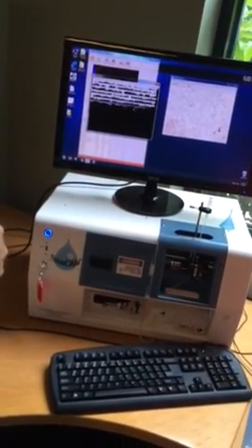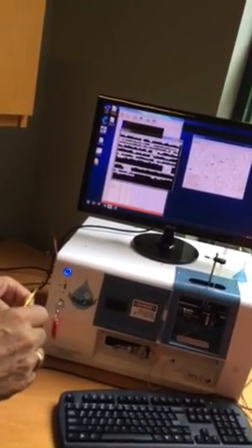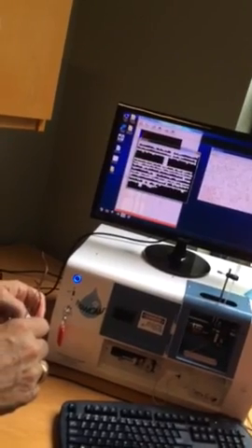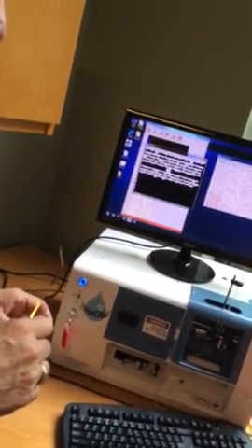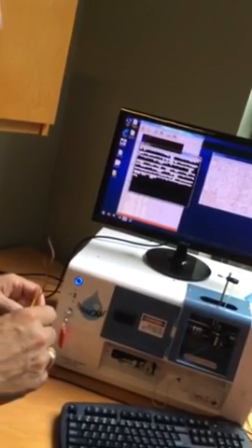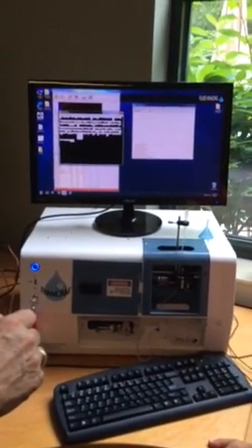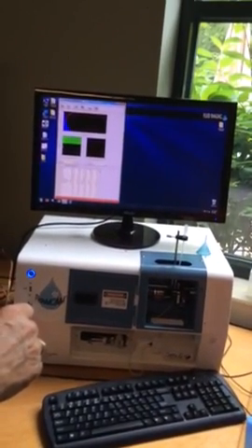We have a clean flow cell. Inevitably you're going to have your flow cell in there and like one little guy stuck to the side of it, and you can still use that flow cell, but you're going to have to make sure that it has been imaged as part of the background. We can do that in auto image mode. I'm having a problem with, oops, these pass through so fast at 4x.